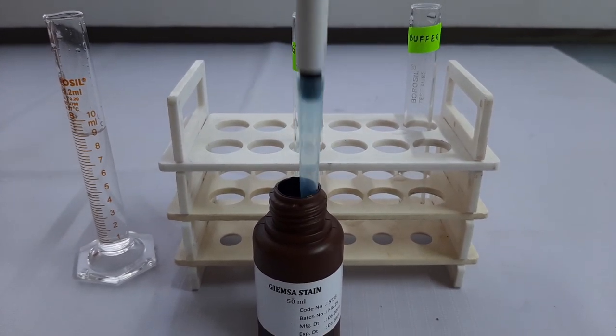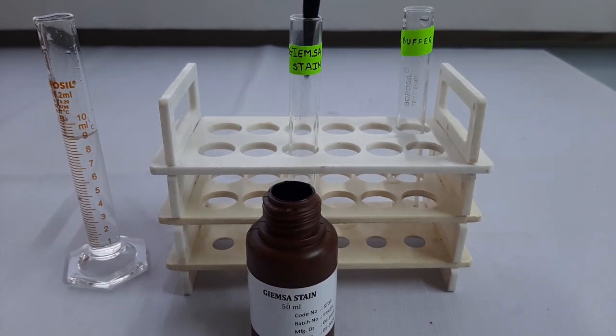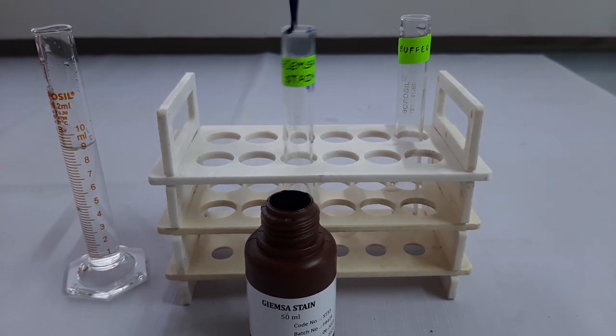We will take 1 ml of Giemsa stain and then add it to a second tube where we have previously labeled for the Giemsa stain.